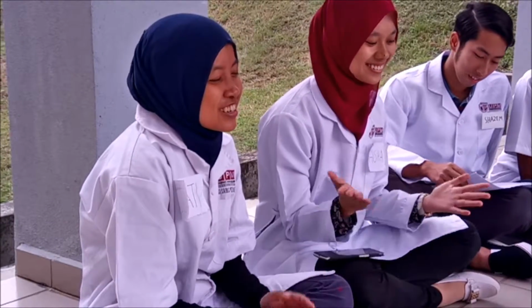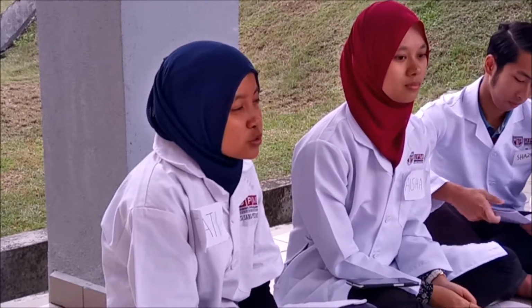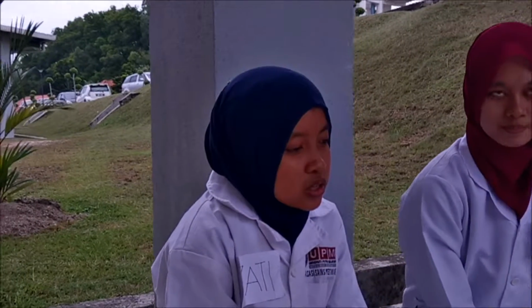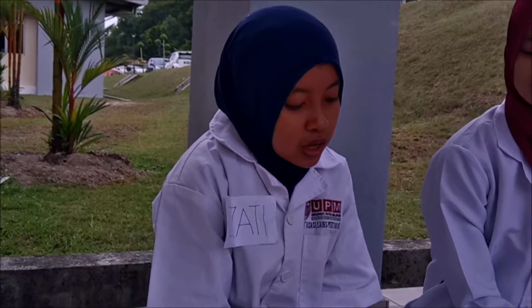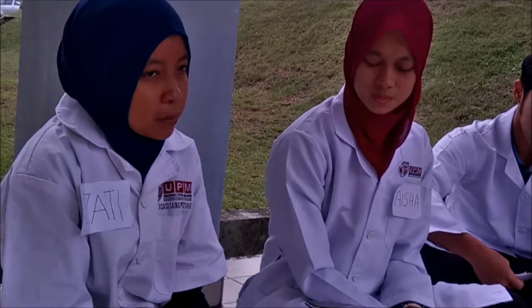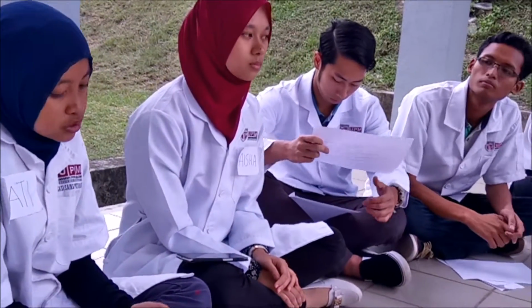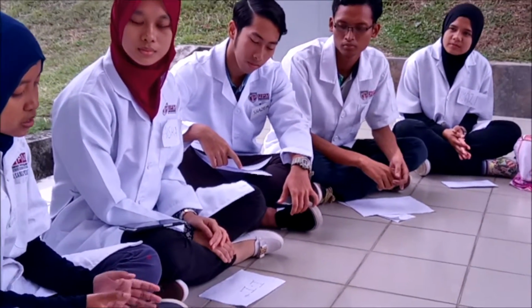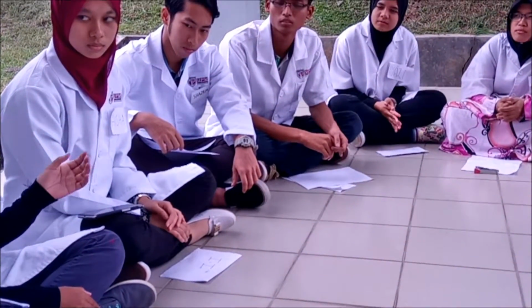Okay, so today we are going to discuss the fingerprint role of spectrophotometry in bioassays. So firstly, what is spectrophotometry? Spectrophotometry is a method to measure how much a chemical substance absorbs light by measuring the intensity of light as a beam passes through a sample solution. The basic principle is that each compound absorbs or transmits light over a certain range of wavelength. This measurement can also be used to measure the amount of a known chemical substance.